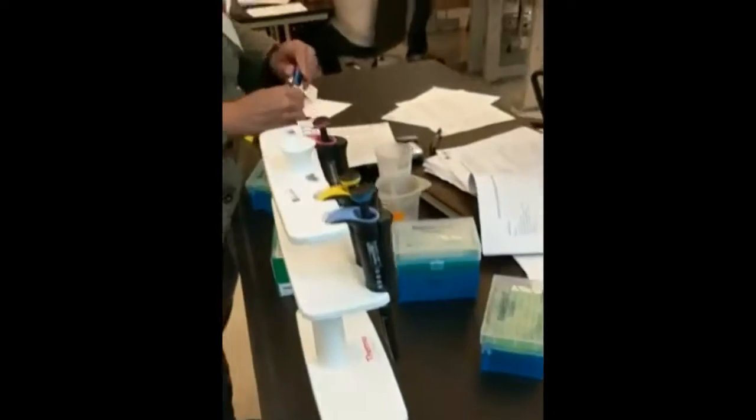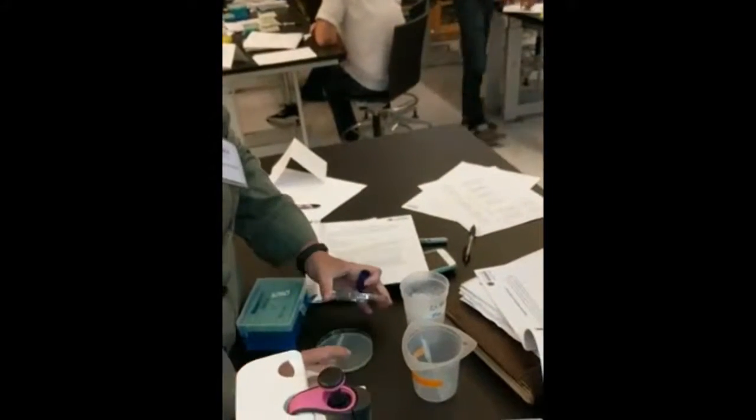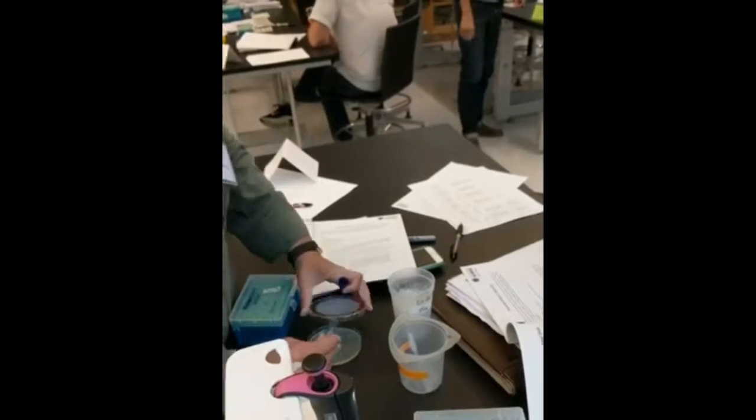Pour the used glass beads into the container on the bench containing the Wescodyne disinfectant. These will then be washed and re-sterilized. Do not reuse the beads. Your lab fellow will incubate the plates agar side up overnight.